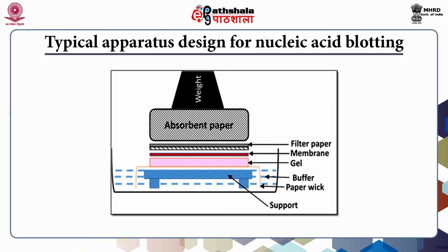Although electrophoretic transfer of nucleic acid from gel to membrane is feasible, as in case of Western blot, the assembly as shown in the diagram is equally effective in transfer of nucleic acid to membrane. The assembly essentially has a platform for placing Whatman paper, gel, membrane, adsorption paper, and weight in sequence.